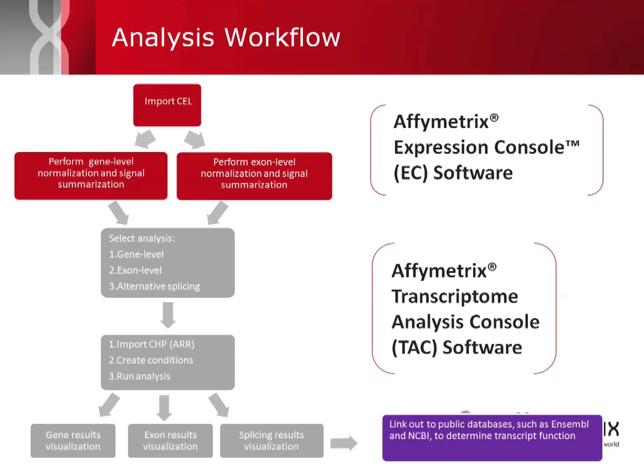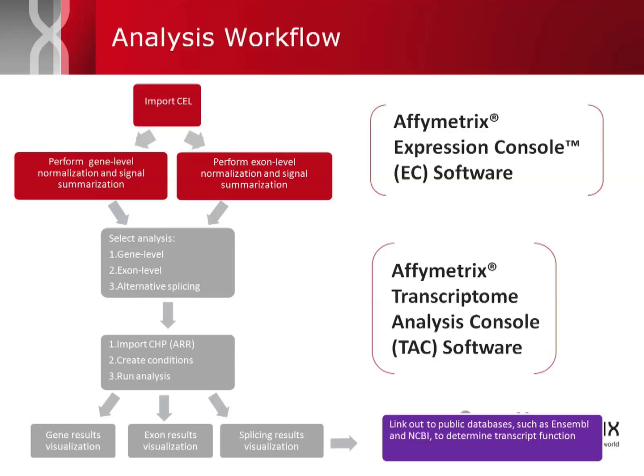Affymetrix has two software packages which are used to analyze expression arrays. Expression Console, which has two functions. The first is to generate the probe set signal summarization, or the actual signals off of the array, and second, to evaluate the QC metrics to answer the question, did my array work? In addition, they have a software package called Transcriptome Analysis Console, or the TAC software.